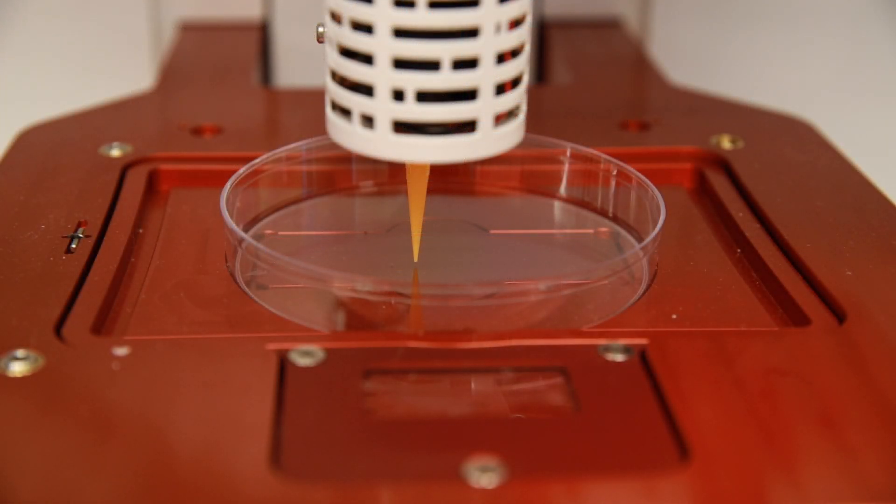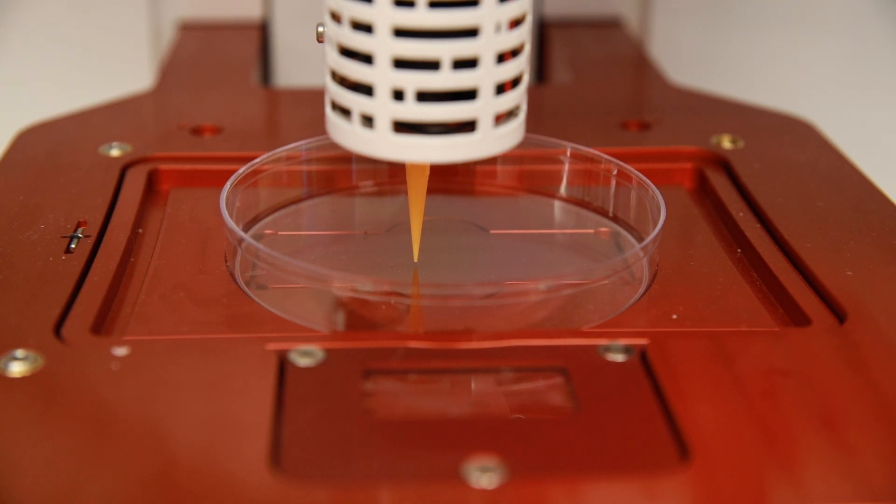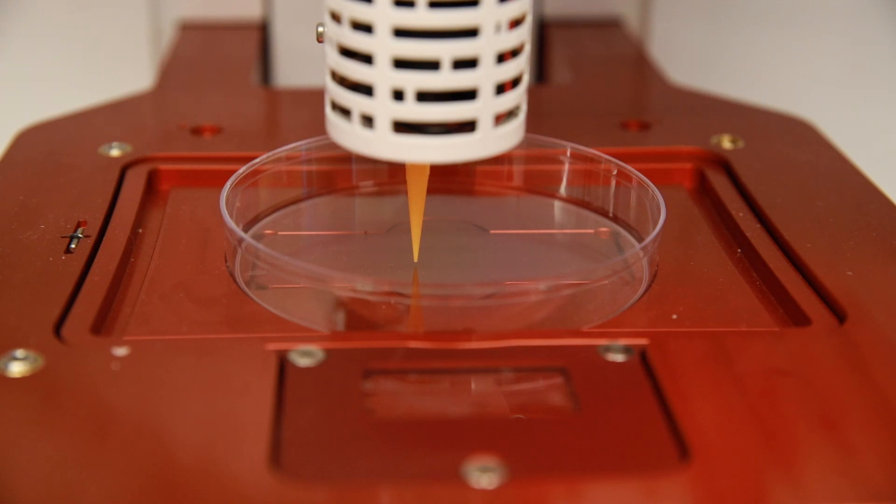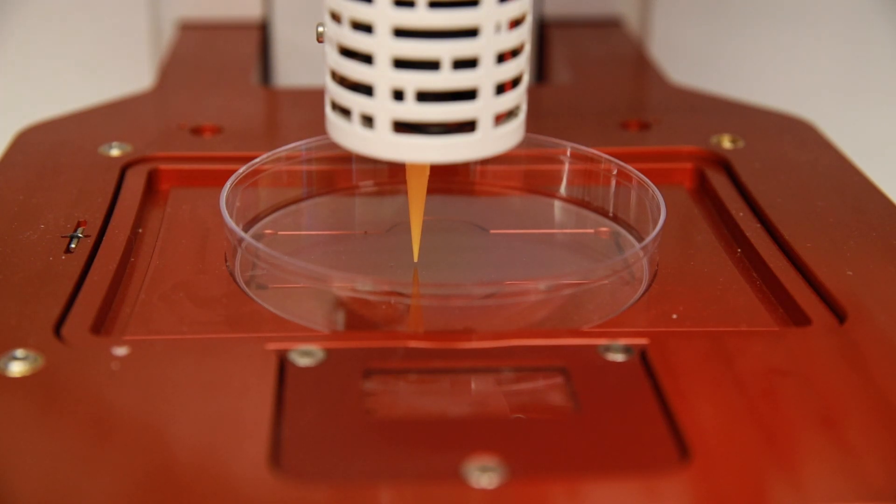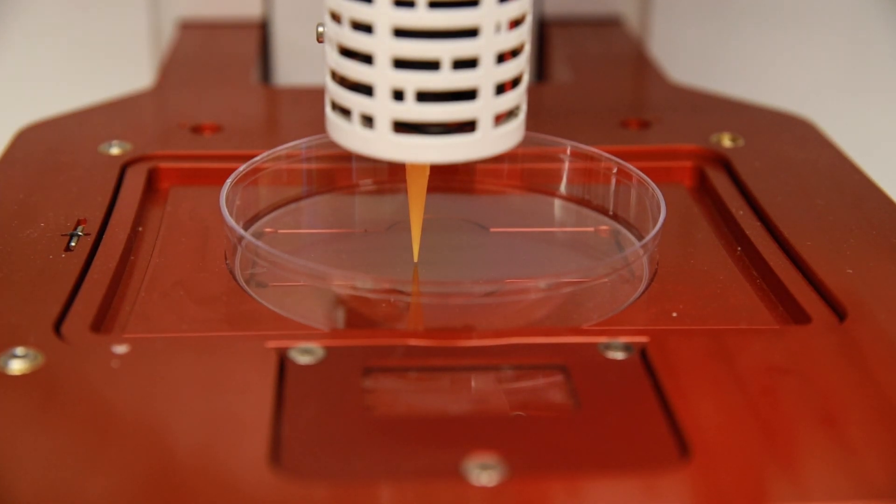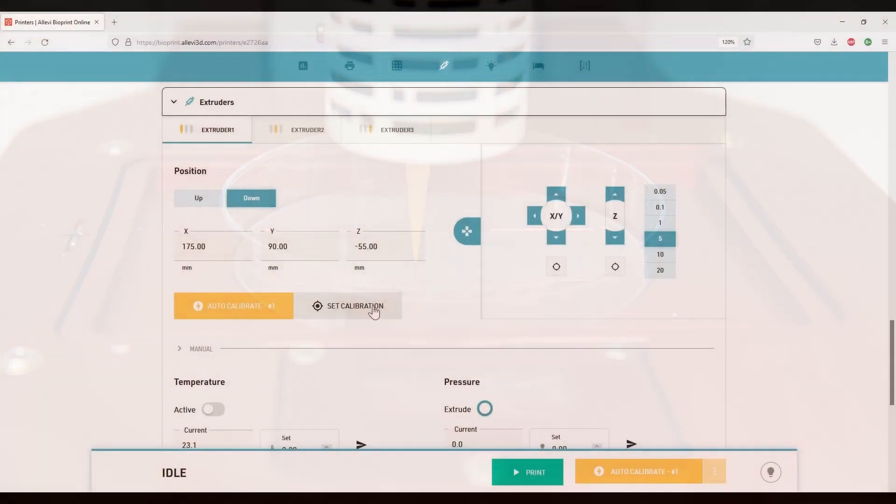To ensure that the needle is properly calibrated, closely observe the reflection of the needle on the build surface. The needle and its reflection must be touching each other. After properly calibrating, click on set calibration.